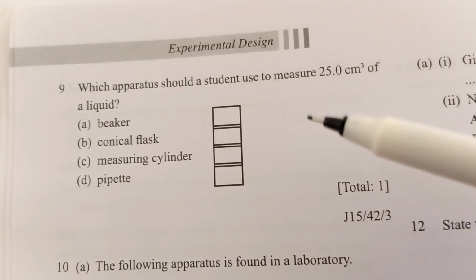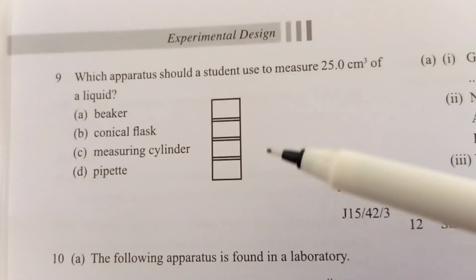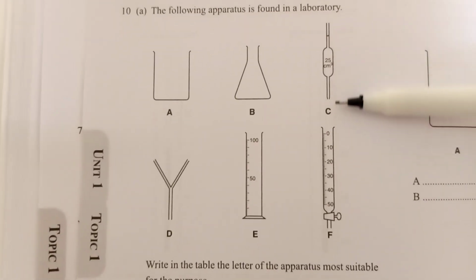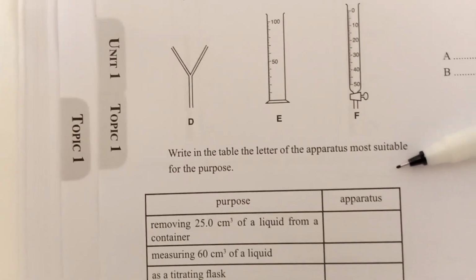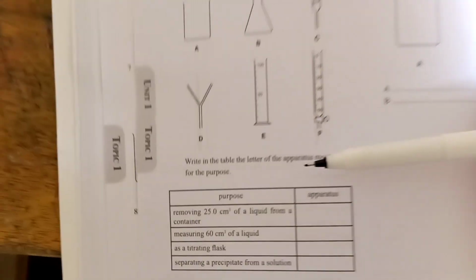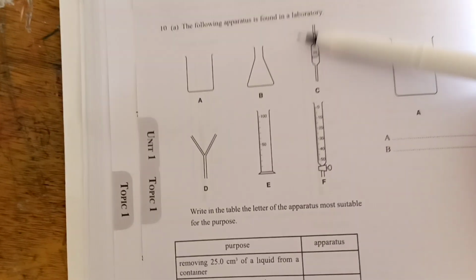Now this one, 25 centimeter cube of liquid, it is a pipette. Already seen this. The following apparatus is used in the lab. Write in the table the letter most appropriate for each purpose. Removing 25 centimeter cube of liquid, we use a pipette.